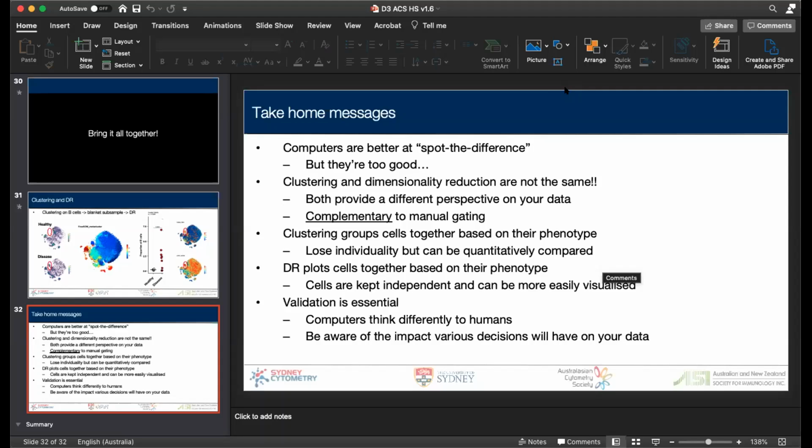I actually get this a lot with my progenitor groups, because I'll gate, say, myeloid progenitors, and on t-SNE they'll be split into their different lineage islands. And I'm like, well, actually, there doesn't have to be a right answer there, because they're all connected. But I suppose it suggests to me to change the way I think about how I identify those populations, because it isn't exactly plus or minus. That's not exactly a firm answer to that question.